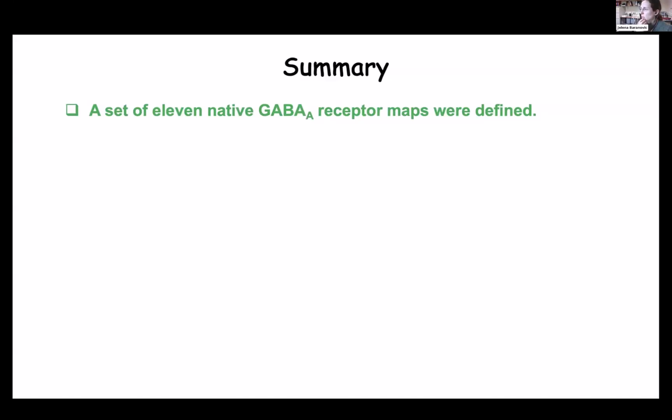Okay, so the next question is, were you able to resolve any glycosylation? And if so, was its structure similar for each subunit across different subunit combinations? This might tell you something about where in the cell they were. Good point, actually. Oh, the glycosylation. Wow. We indeed can tell the glycosylation.